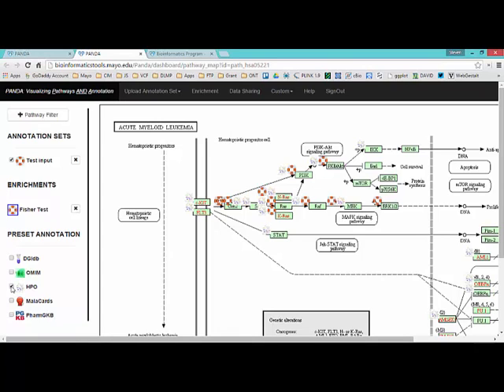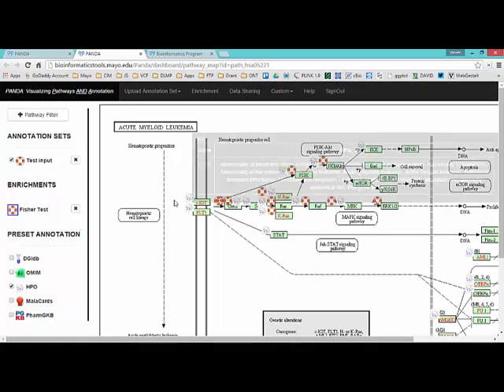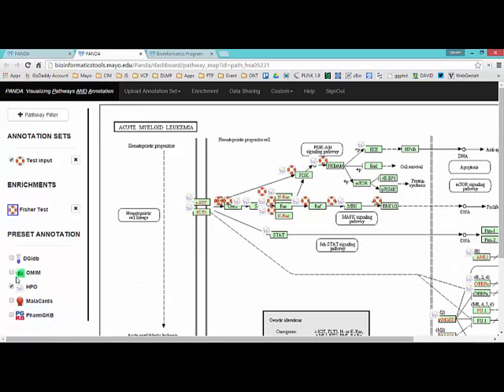Also HPO, a lot of these have Human Phenotype Ontology terms, and we'll just look at examples of those. So some of these have actually a lot of them. So FLT3, they have abnormality of the blood and blood-forming tissues, etc., etc.